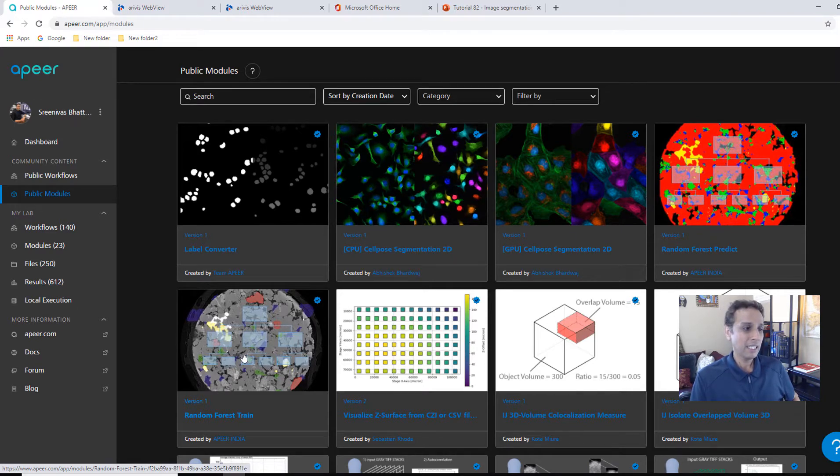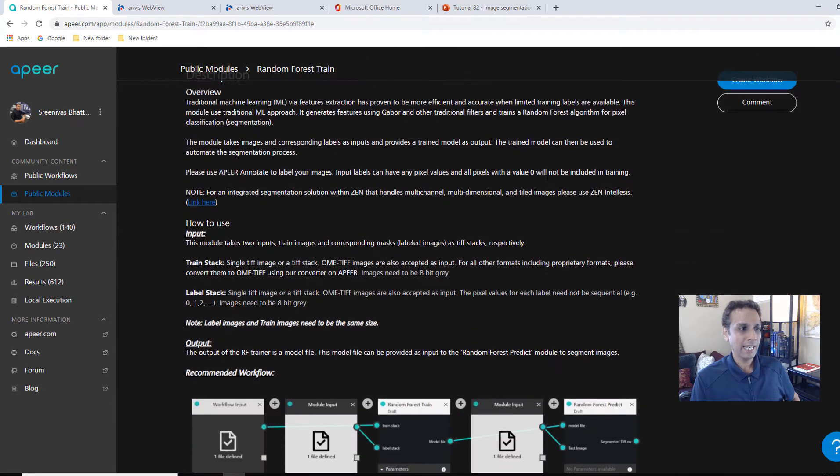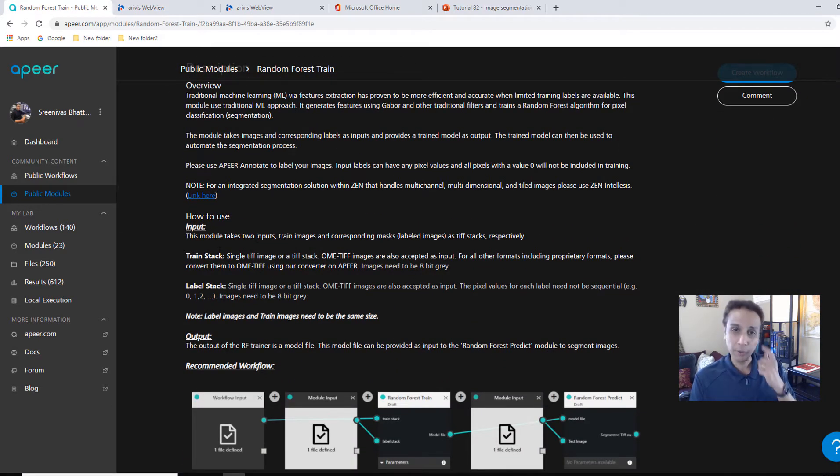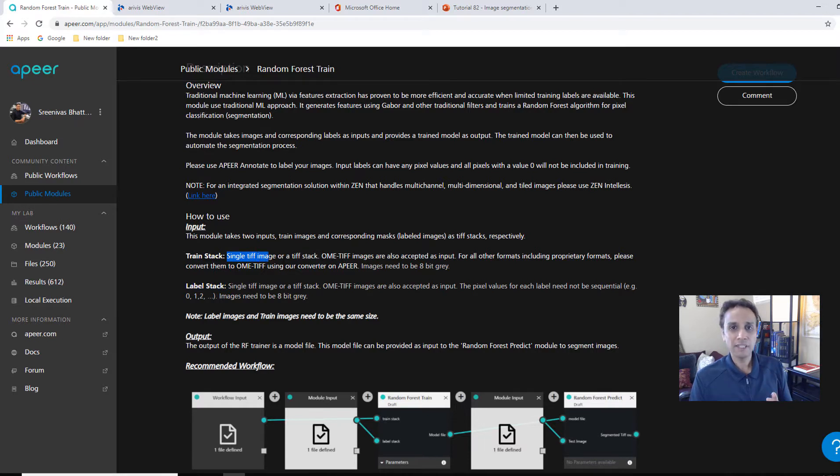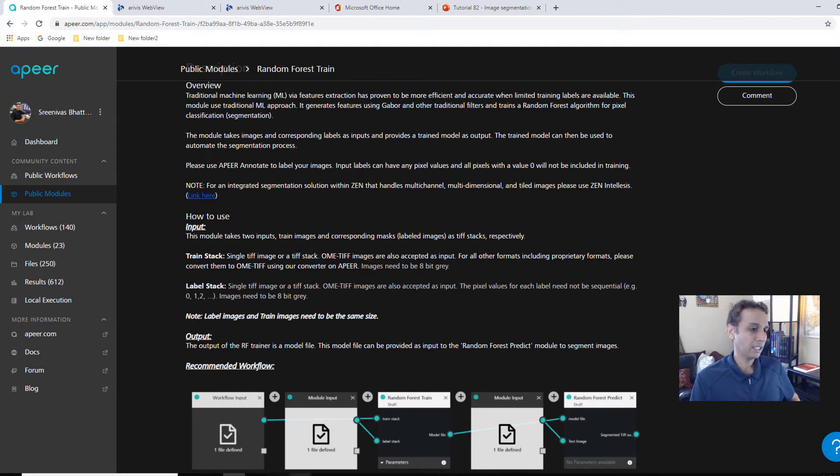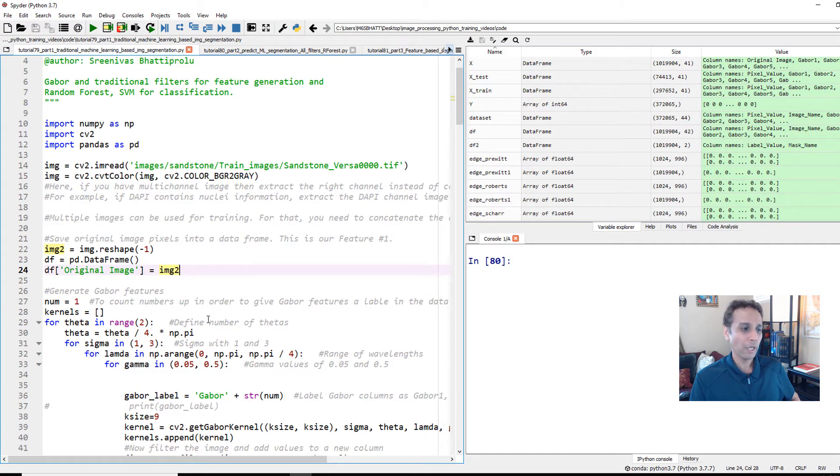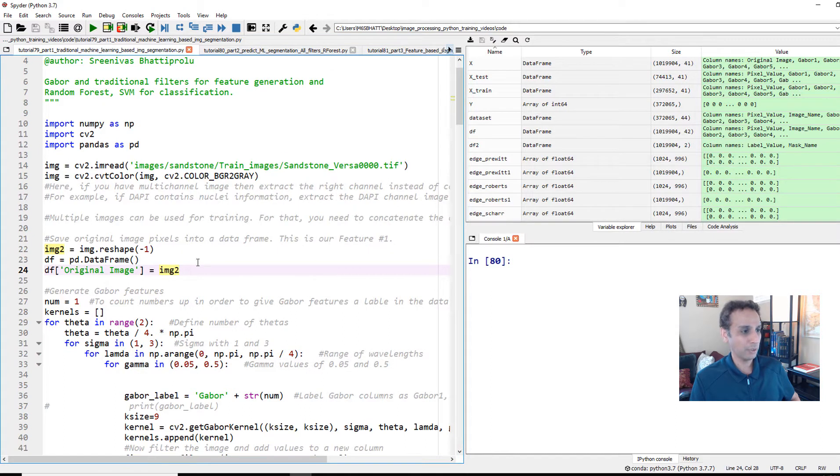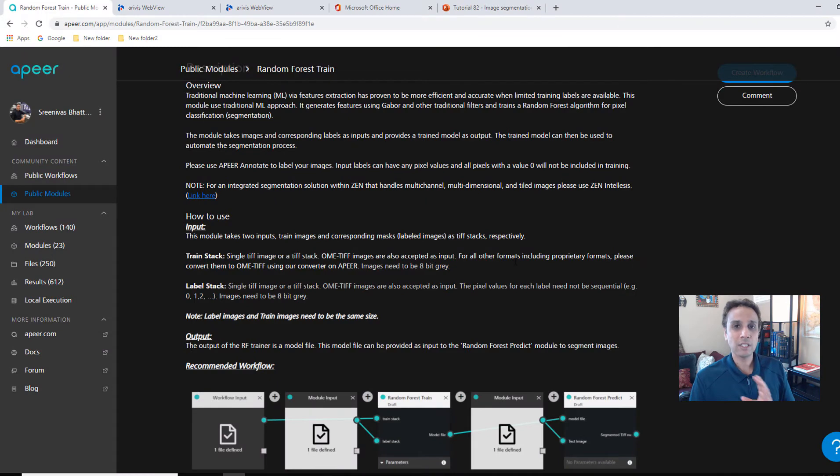The random forest predict and random forest train are the modules we're going to use. And you can click on a module to learn more about it. And here it says that it takes two inputs. The first one is a train stack. And the second one is a label stack. And this train stack is you can give a single TIFF image or a TIFF stack. I think TIFF stack is always better. So you can work with multiple images.